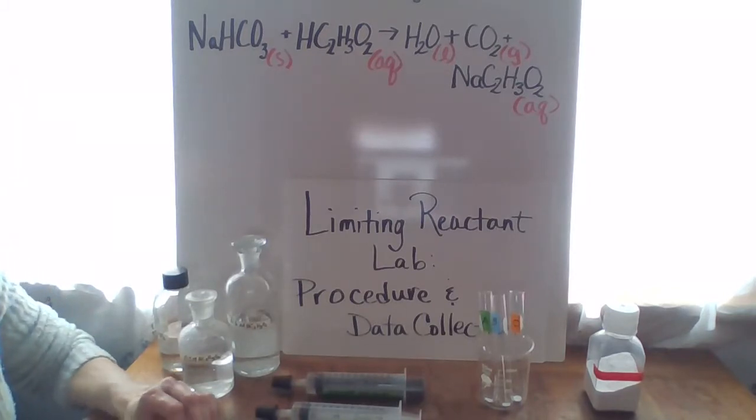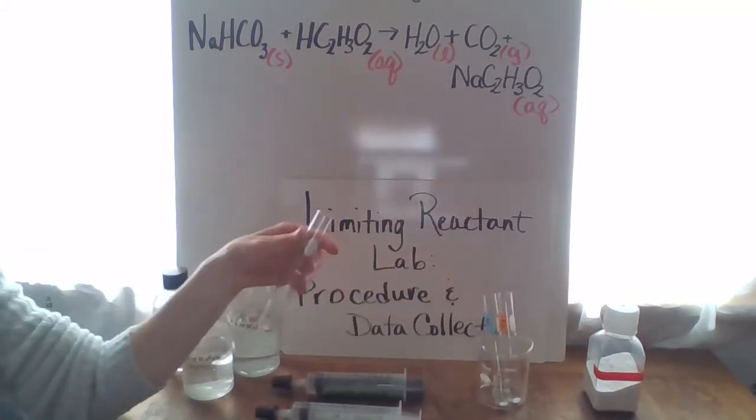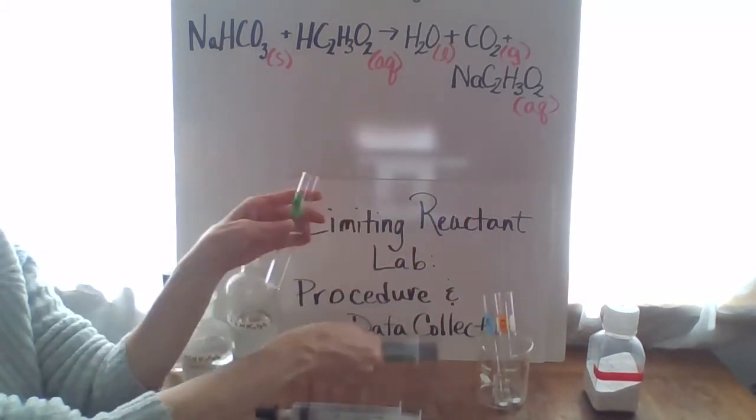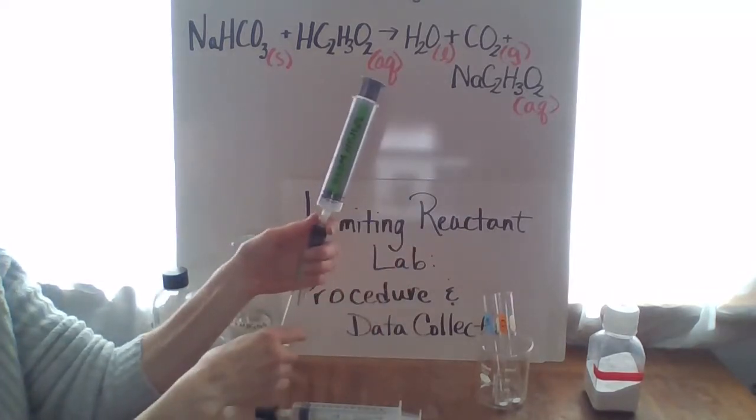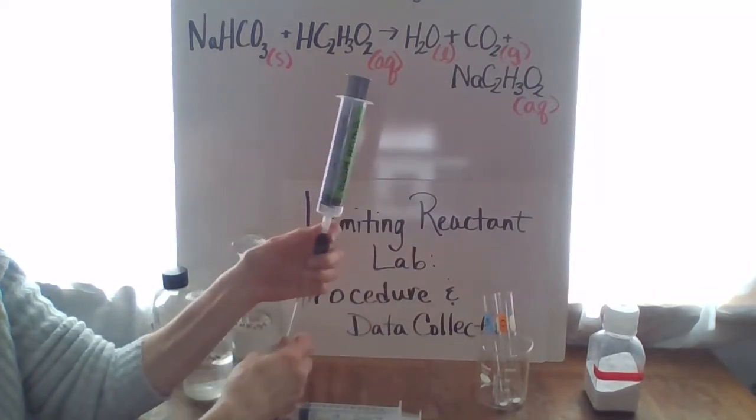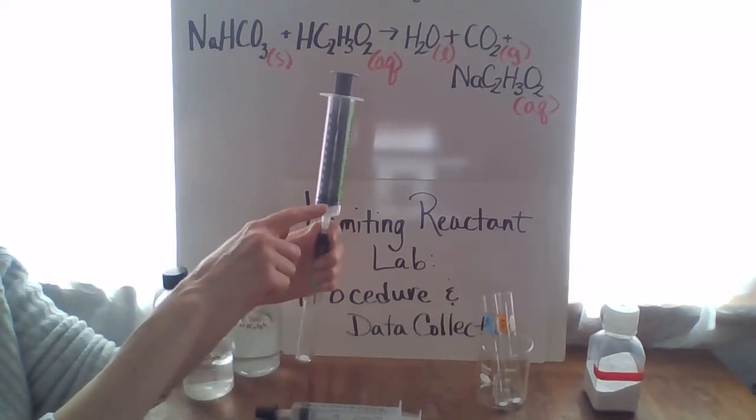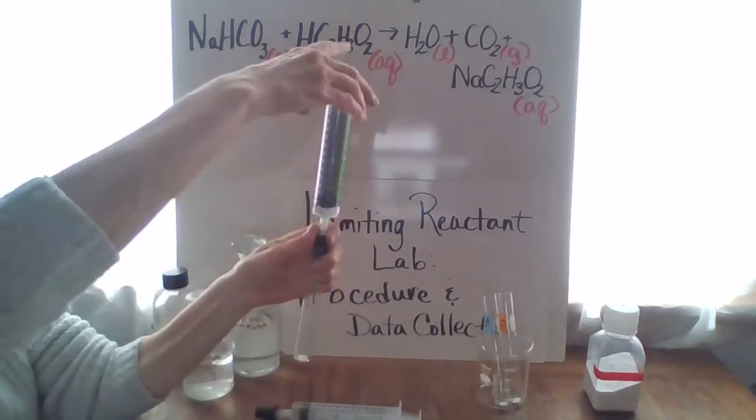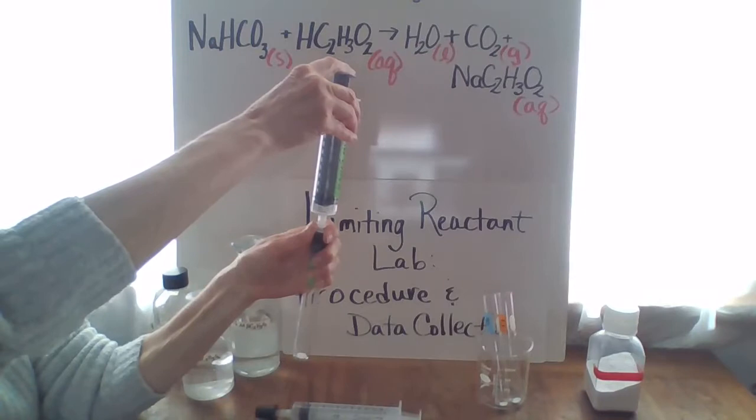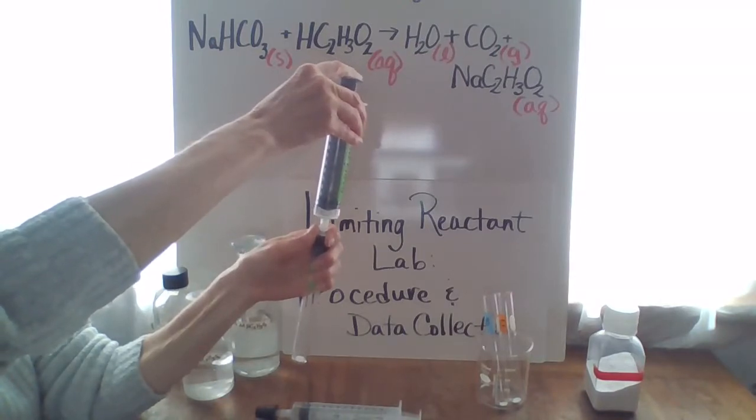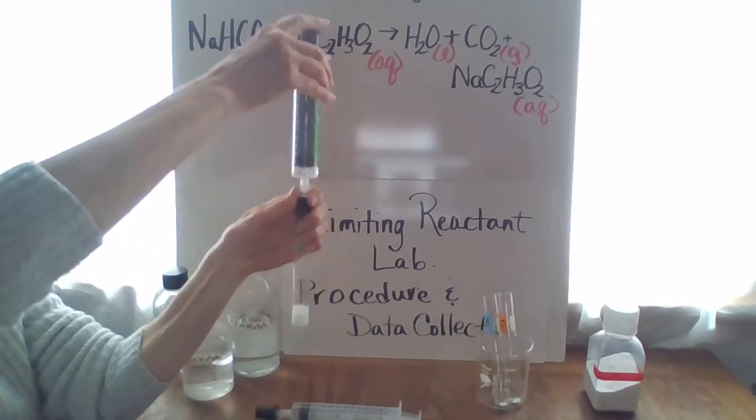I'm going to put those together, so if you follow along with the procedure I'll start with reaction A and attach the syringe and stopper to reaction A. We can see that right now I've drawn up five milliliters of the acetic acid. What I'm going to do is make sure that the stopper is sealed and then slowly add the acetic acid into the test tube.